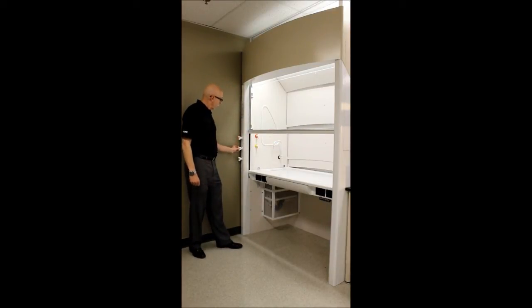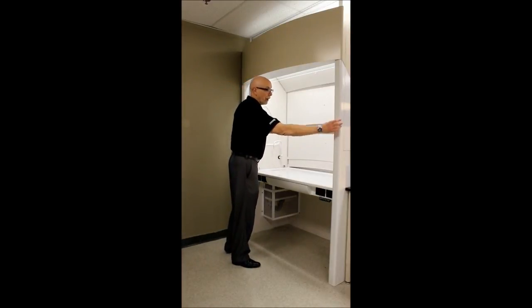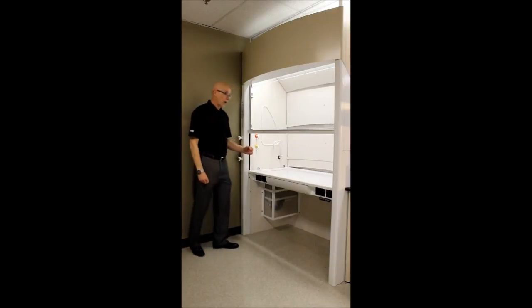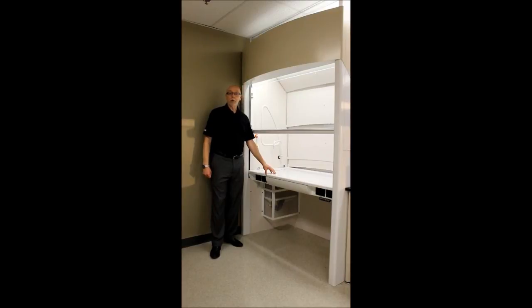Narrow posts allow for more room within the fume hood. The average post on a fume hood is approximately 5 inches; these are about 3 inches, so you're gaining almost 4 inches of interior space horizontally, and you still have plenty of room for fixtures — these particular ones are set at ADA height. For any thoughts, comments, questions, or need for this type of fume hood, please reach out to us at Mott.